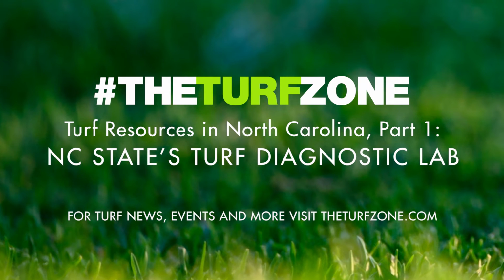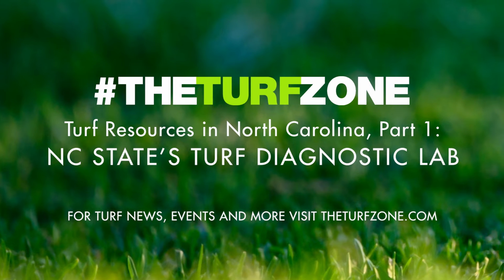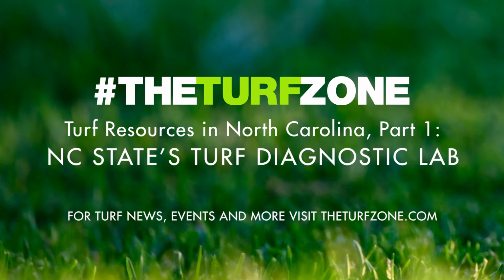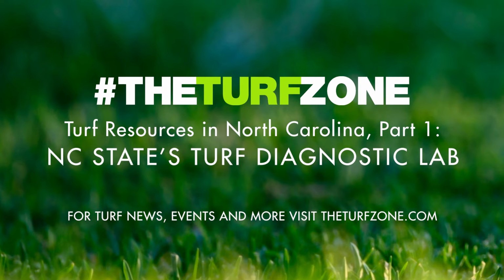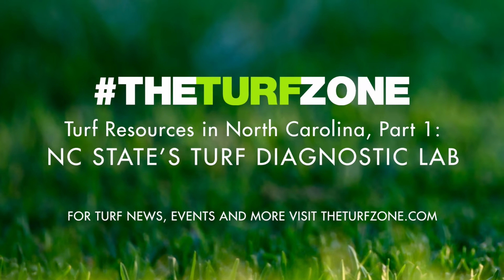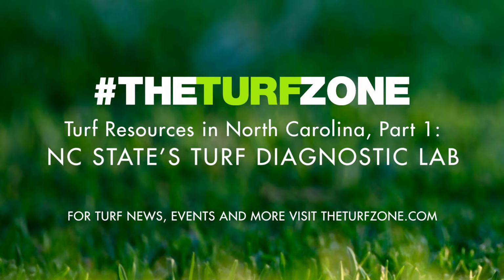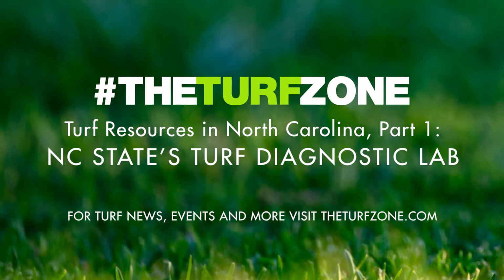Lee is a well-known and respected diagnostician that has helped countless turfgrass managers in North Carolina and beyond. His work is a tremendous benefit to the turf industry and one professionals should recognize and take advantage of when dealing with turf diseases. To use the services of the lab, you'll first need to collect and submit a sample.